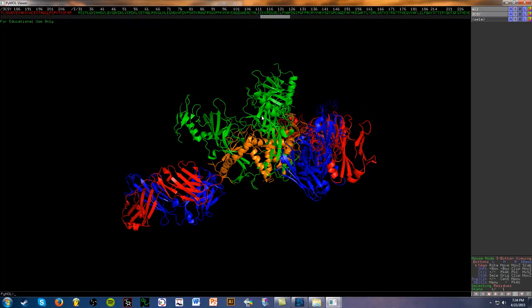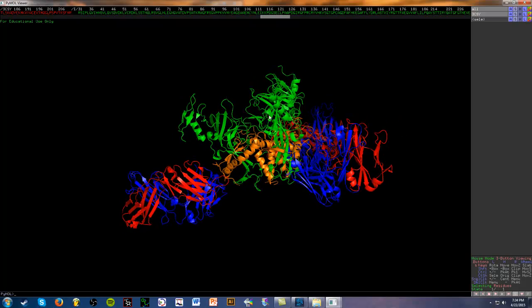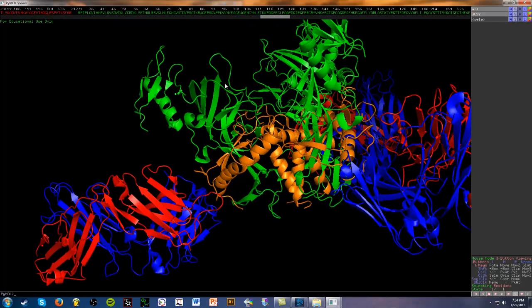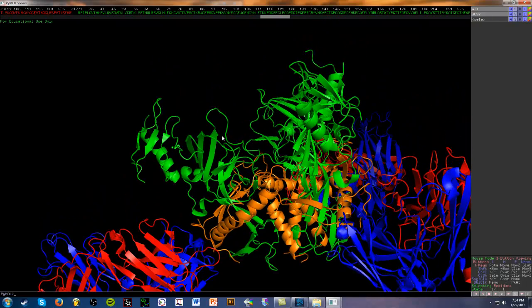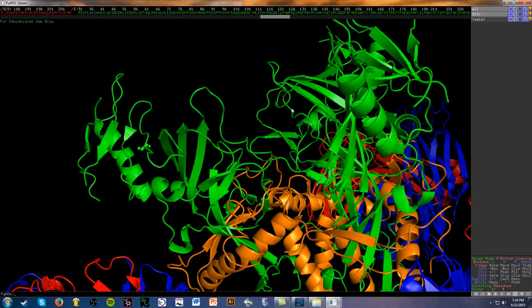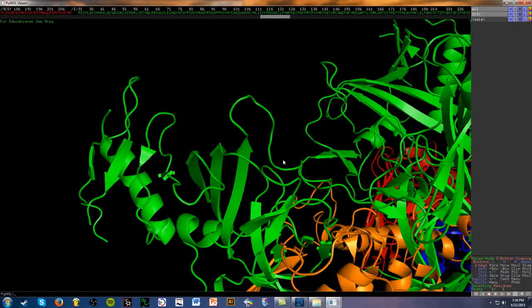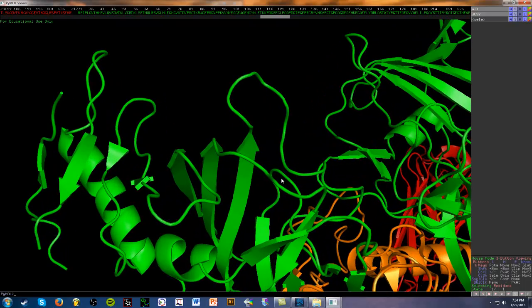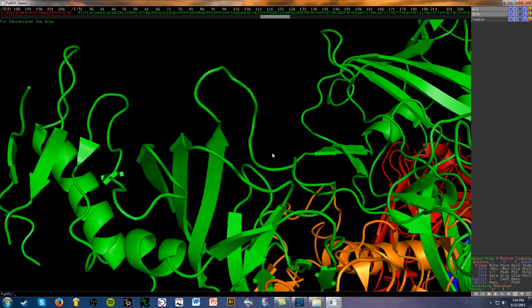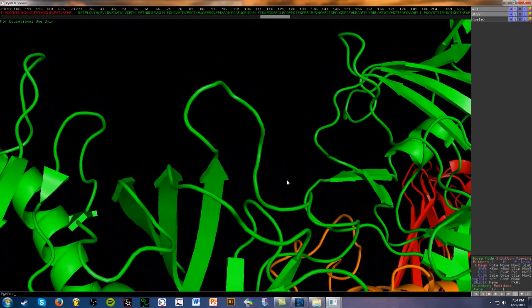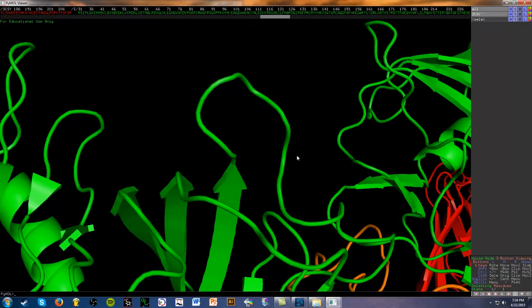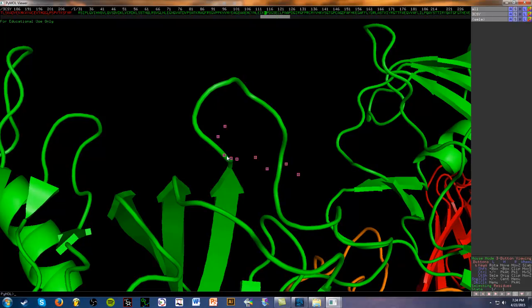So first what we're going to do is select a loop that we want to do our deletions in, and I've chosen this area right here for clarity purposes, and I'm going to zoom up to it so we can see this better. Okay, perfect.